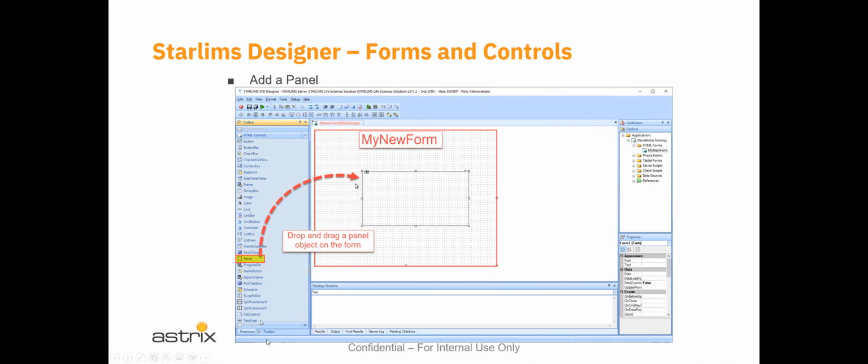So now we have the toolbox component of the left-hand pane. Well, I actually didn't select it for some reason, but anyway, I took a screenshot, so I apparently didn't quite get that right. But this toolbox will be active, and you'll see all of these controls appear. Now, I won't go over every single control, but we're going to go over a fairly hefty little component of it because these are the ones that we use most of the time.